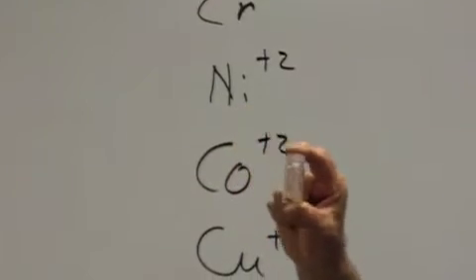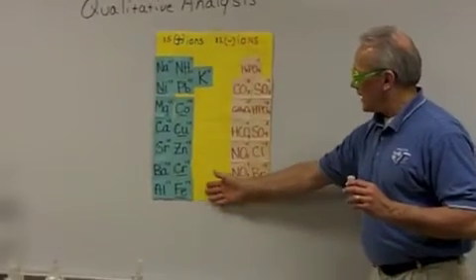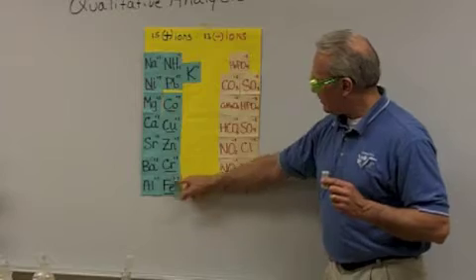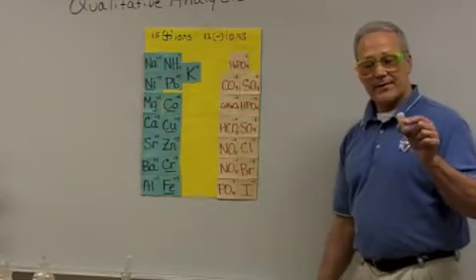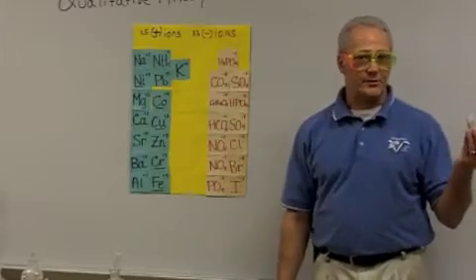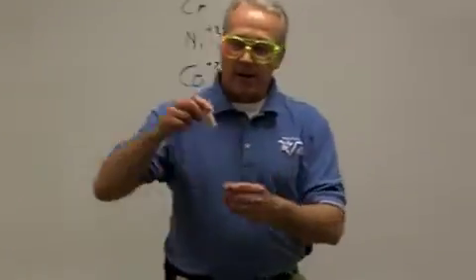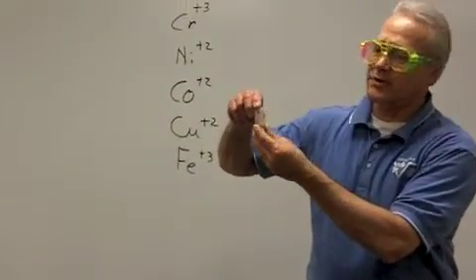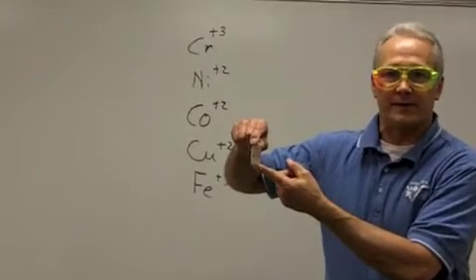For as we look at this, we go over to our table here. Of the 15 positive ions, there's only 5 that are colored, namely iron, chromium, copper, cobalt, and nickel. And the fact that this is a colored compound tells us we must have one of these 5 ions. So that's a significant clue. As we look at this also, we can see it's moist and has crystal formation. So that's part of the inspection test, and I'll give you a moment to jot this down.